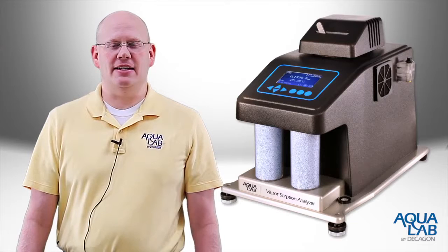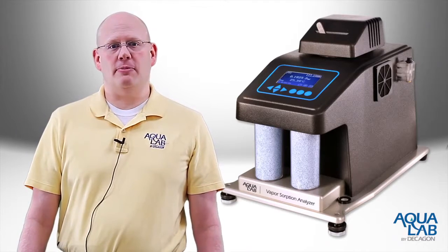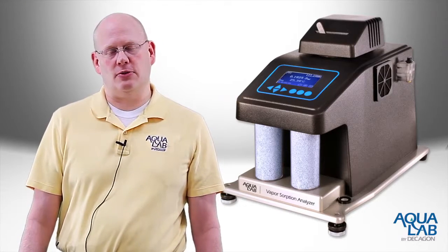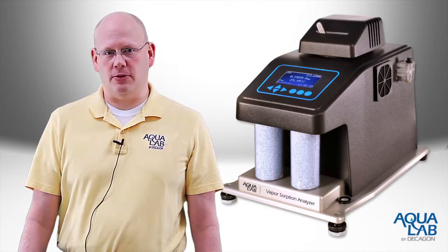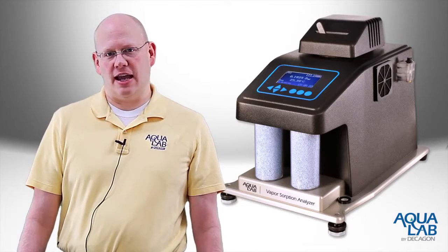Since DVS and DDI isotherms each provide unique information, the ideal vapor sorption analyzer will be able to provide both dynamic and static isotherms. The Aqualab vapor sorption analyzer is the only instrument available in the market that does both dynamic and static isotherms.